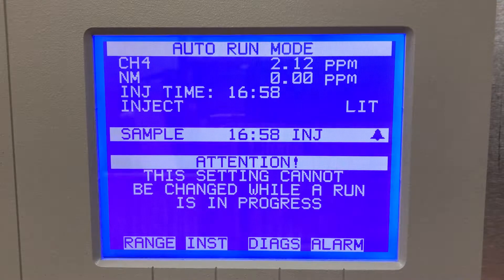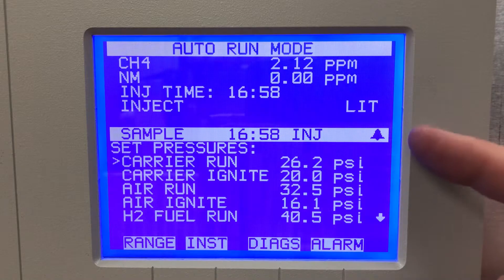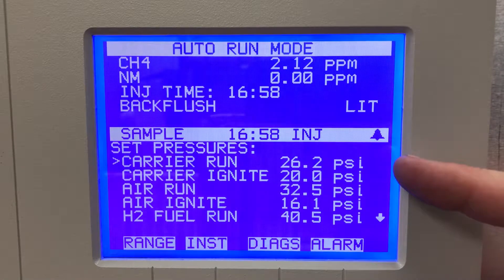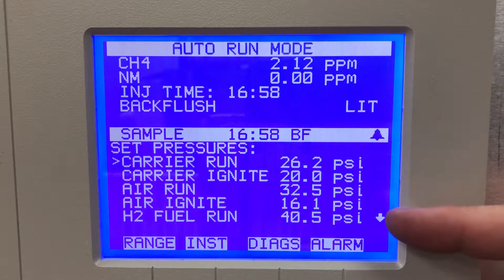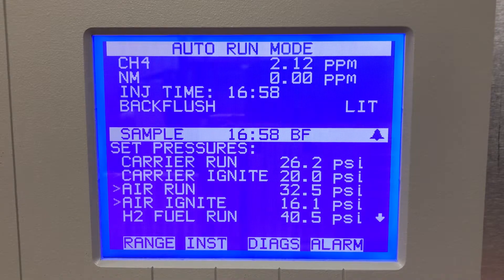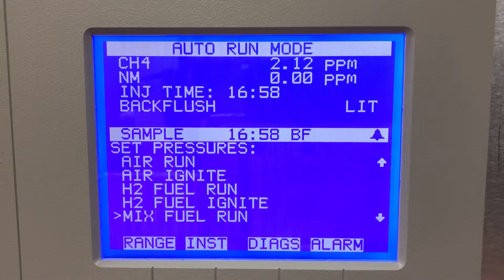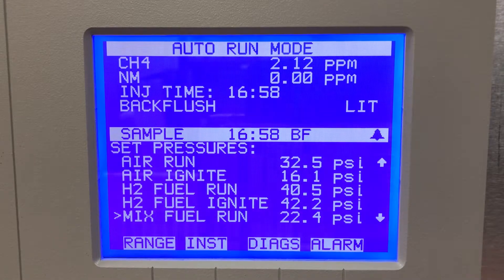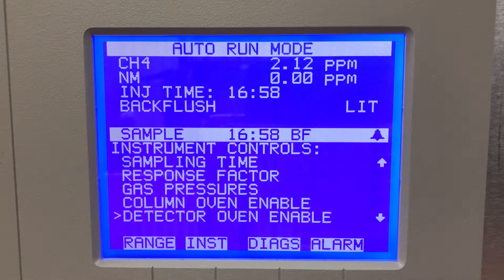Sampling time — it won't let me go in here because I'm sampling right now. Response factor, gas pressures — this will tell me what my carrier run and ignite are. That's nitrogen. My air run, air ignite for the FID, my hydrogen run and hydrogen ignite — so this is hydrogen fuel run and ignite. You can adjust all these pressures and have a mixed fuel if you want.